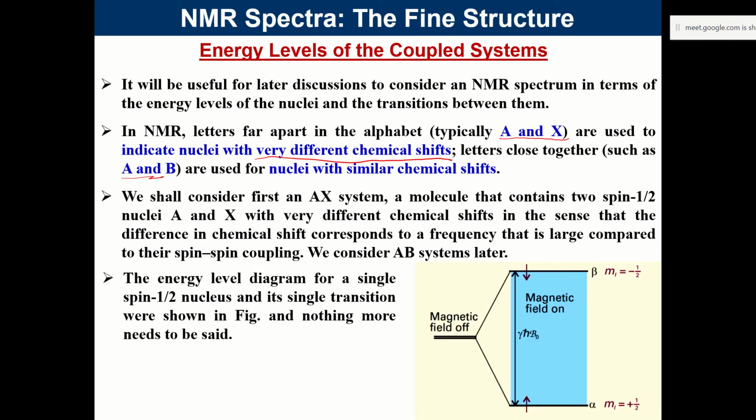Individually we learned how the applied magnetic field affects the spins: when the field is off, the plus half and minus half states have the same energy.